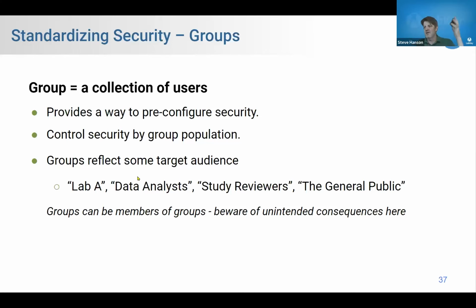That's all security is, just making those relationships. That can be really daunting if you've got hundreds or thousands of users, and you need to assign each user a unique profile throughout the server. That's actually not very tenable.